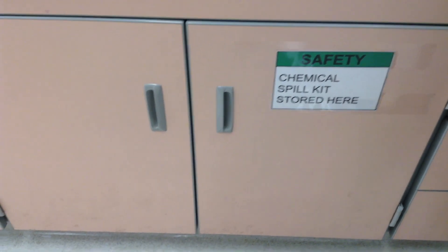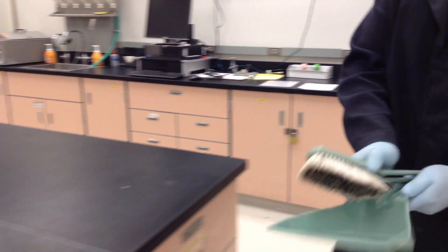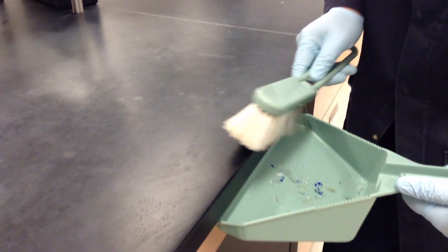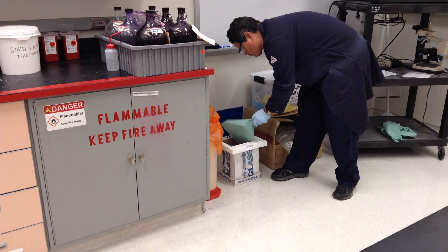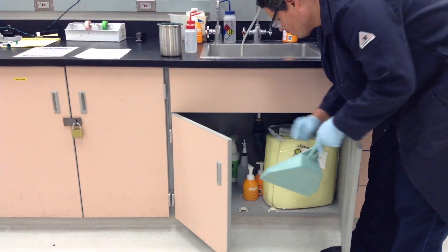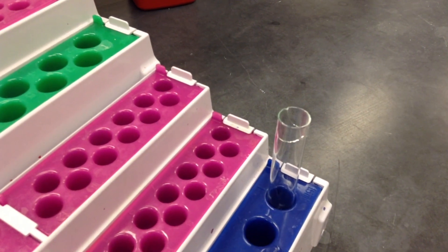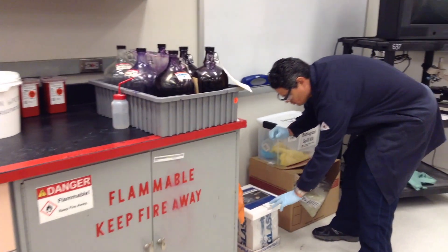To pick up the smaller pieces of glass, grab the dustpan and duster, which are located under the sink next to the chemical spill kit, and carefully sweep up the broken glass. Discard the broken glass in the broken glass container and return the dustpan back where you got it. If you come across a broken glass tube, it must be discarded regardless of its contents. First, appropriately discard its contents and then carefully take the broken glass tube to the broken glass container and discard it.